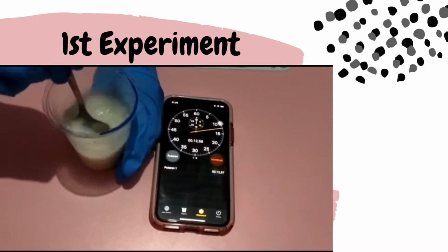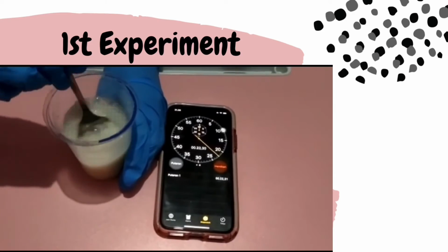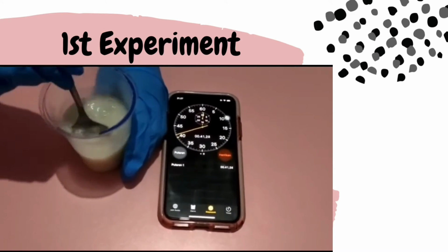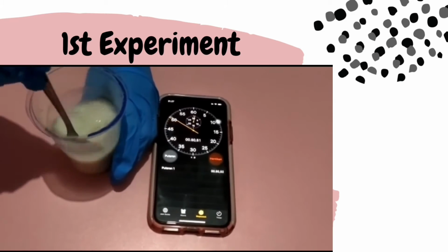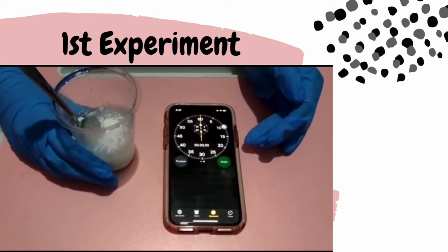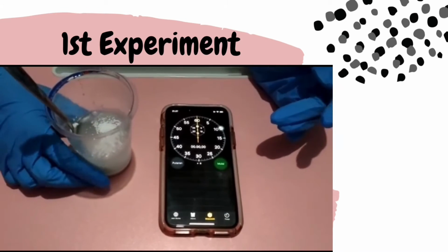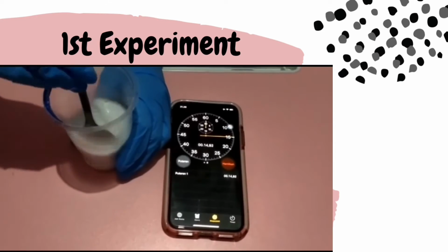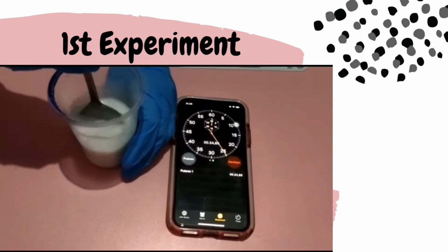Stir it until homogeneous. And the last material we stir is powder. Stir the material until homogeneous.